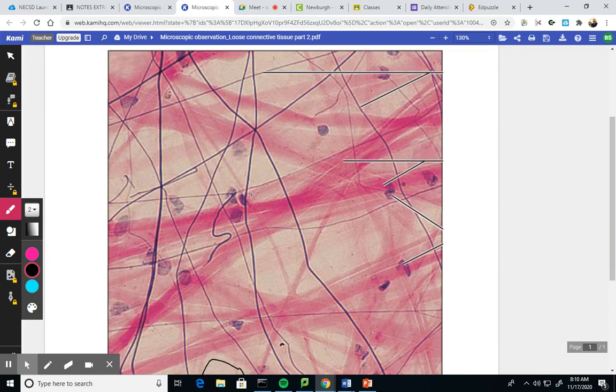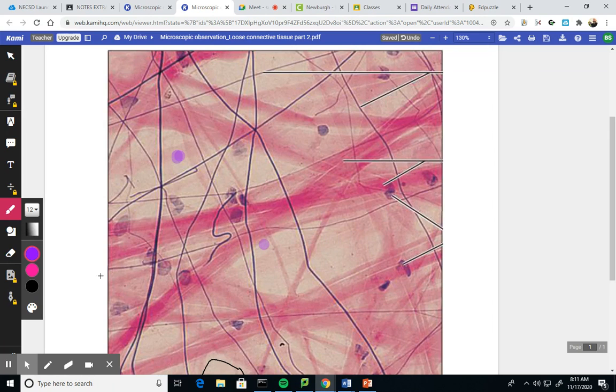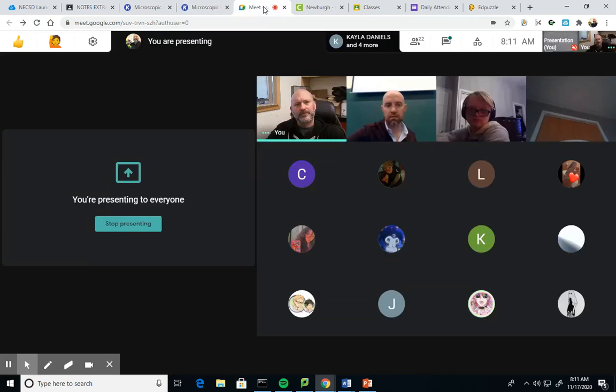If I want to copy this, I'm probably going to use a big font like a 12, maybe a dark purple, and I'm going to give it some transparency, right? Yeah, something like down here. Something like that. Maybe a little darker. We could always go to more colors, right? Get something like really dark like that. Maybe this one, yeah. That's a good match, isn't it? These kind of look like that, don't they? I'm going to go with that.